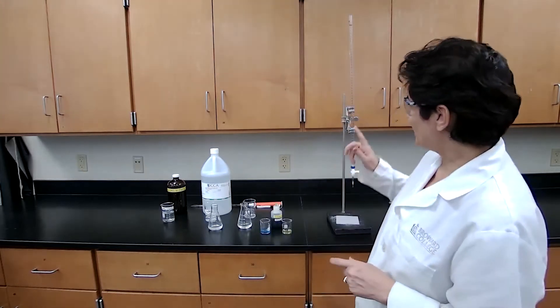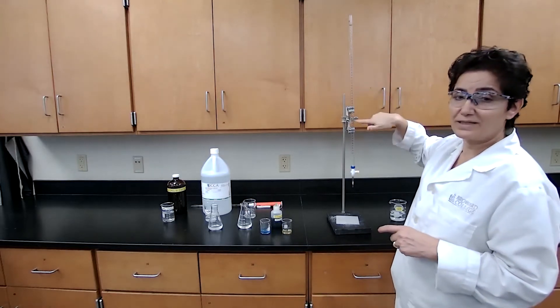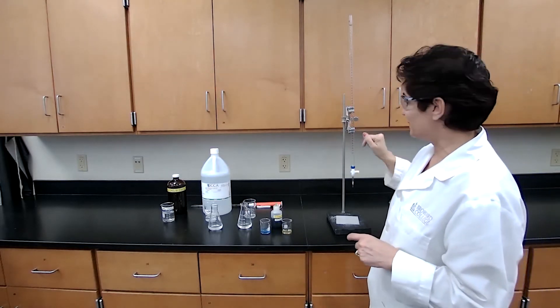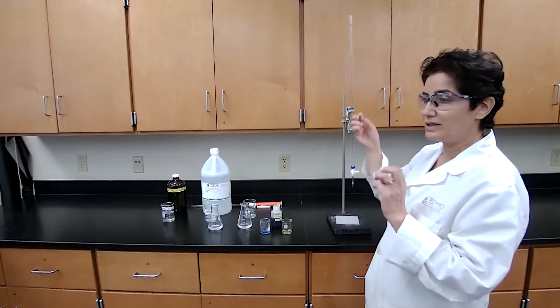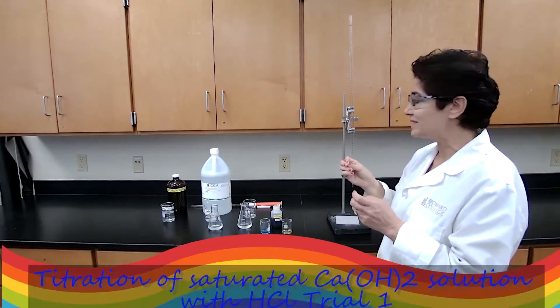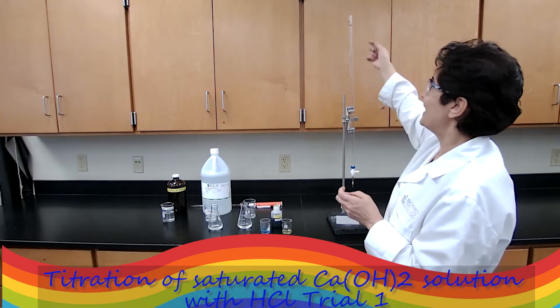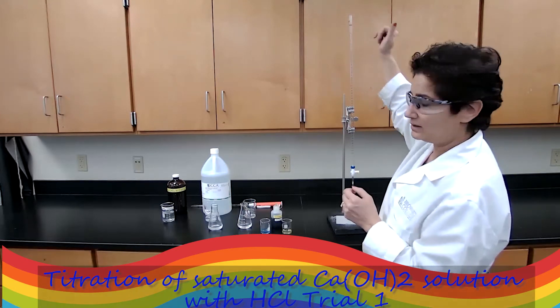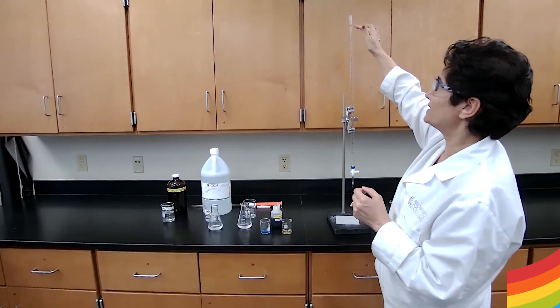Now, practice this, or the actual experiment now. We are using HCl in the burette. Since you've done a couple of the experiments already, you know how to condition the burette first, wash it with HCl, and fill up to zero, or desired number for initial burette reading.